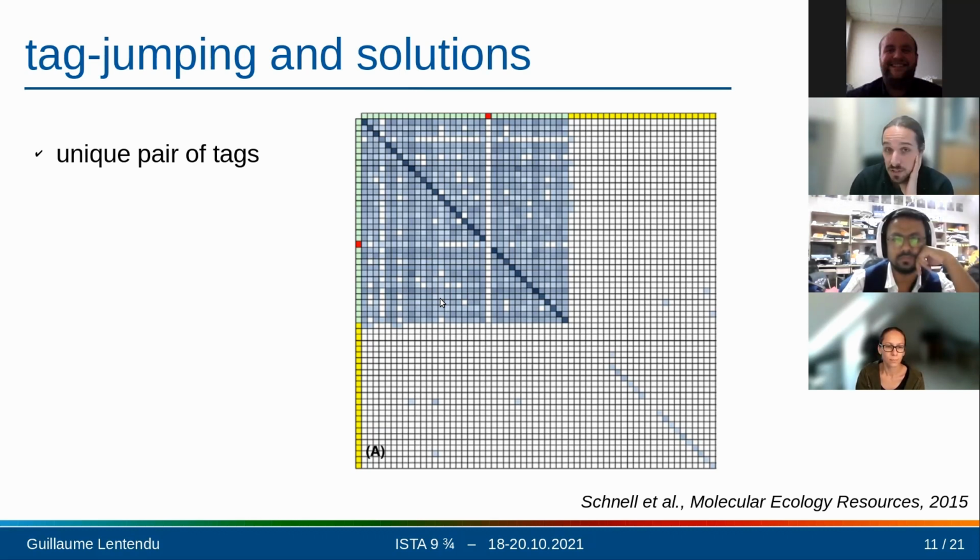But you can already see that if you use all possible combinations of the barcodes, in place of using here the 20 to 25 unique combinations, you just order 5 barcodes and you use the 5 times 5, so the 25 combinations of these 5 forward and 5 reverse, then you will have a much greater amount of tag jump. So that's something really to take care of.